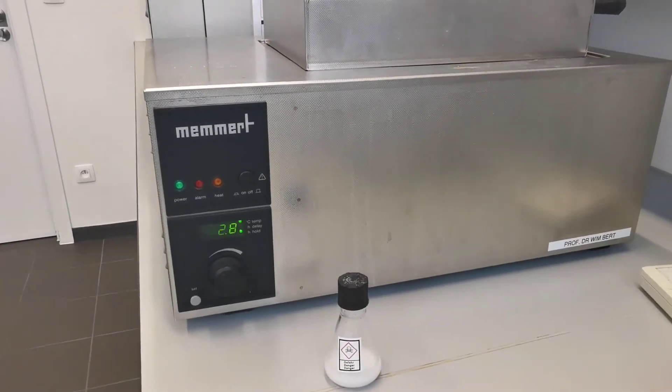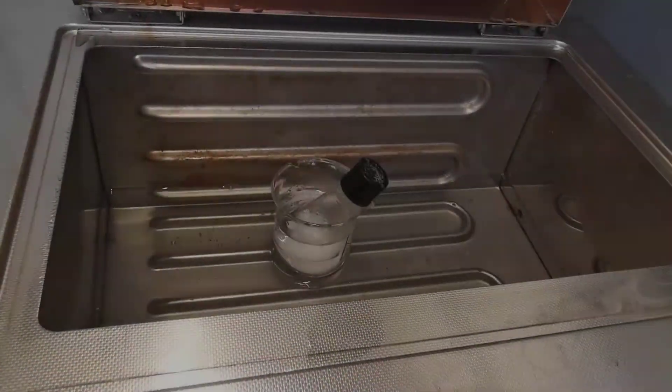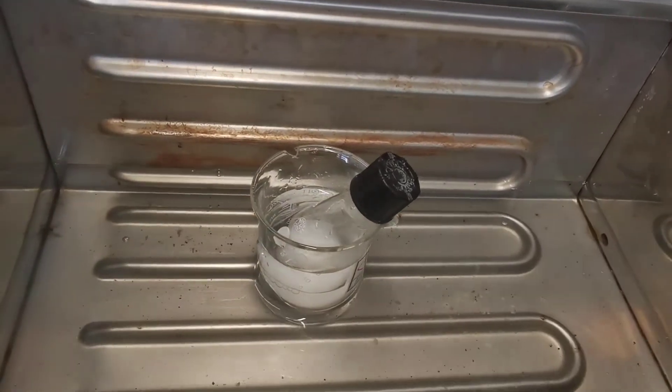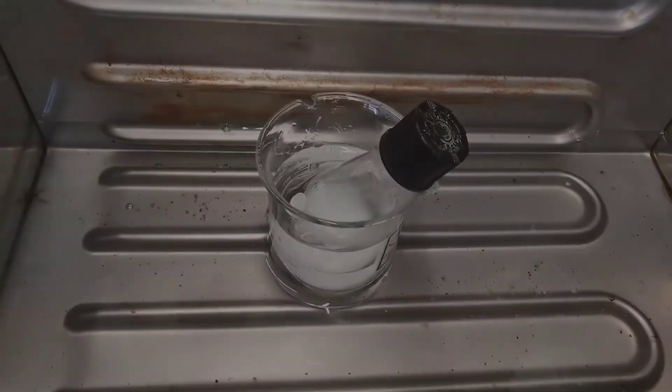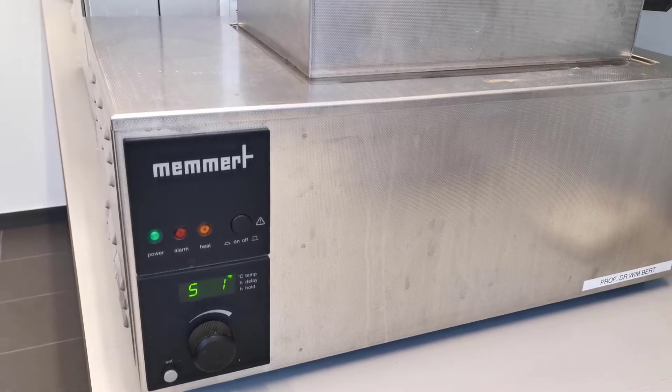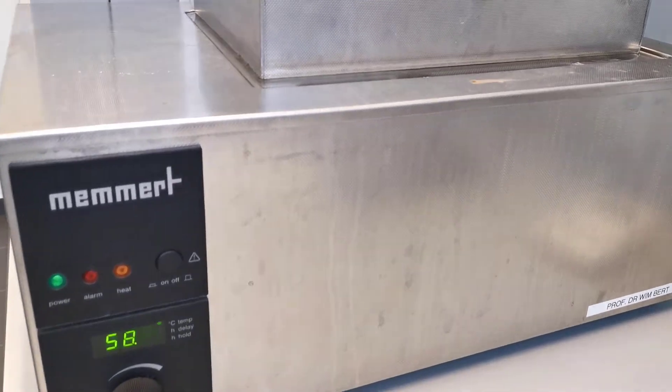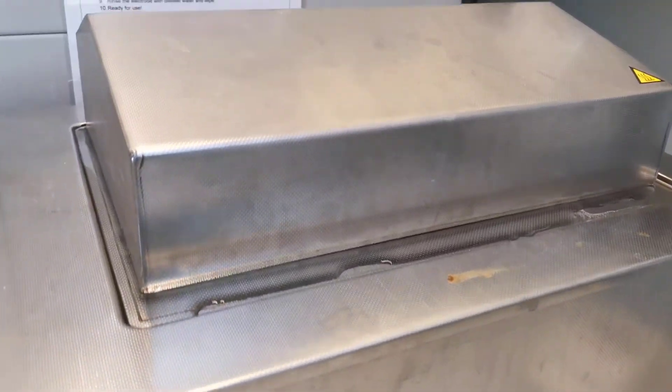A water bath is preheated at about 60 degrees Celsius, and the flask is transferred in the water bath, leaving the lid of the flask a bit loose. The flask is incubated for about 30 to 40 minutes, during which it is swirled every 10 to 15 minutes to help dissolve the PFA powder.